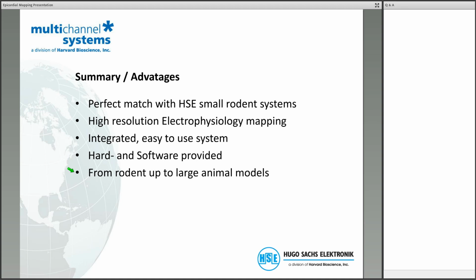We are usually looking at 30 or 100 microns in diameter. And to stimulate a whole heart, you need to transfer a lot of charge. So if you want to stimulate via these electrodes, you have to go to long stimulation pulses, you have to go to high voltage levels, and you will create a certain level of artifacts in your preparation.